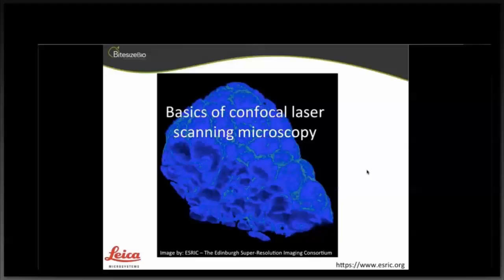Can confocal imaging data be used to quantify structural features such as dendritic spine density, or is the Z-plane resolution too limiting for that? Possibly it could be too limiting, dependent on the thickness of a dendritic spine, which I'm not sure about. But since your resolution in Z is about 500 nanometres, a bit more, then possibly. But if you paired confocal with deconvolution, deconvolution can help to increase the resolution and make your images a bit sharper, so it may help in that situation.